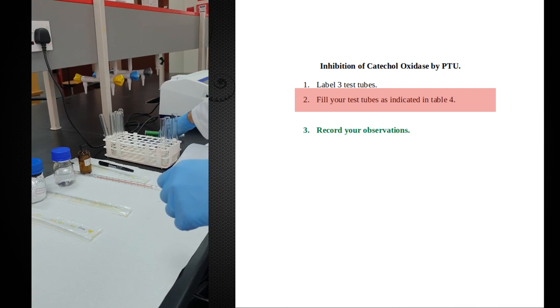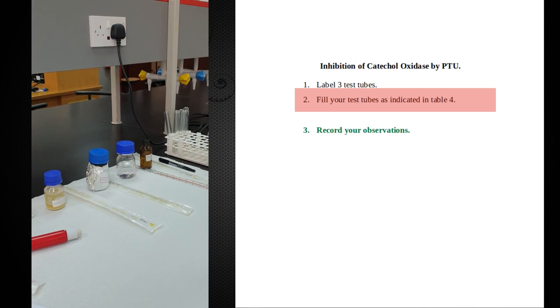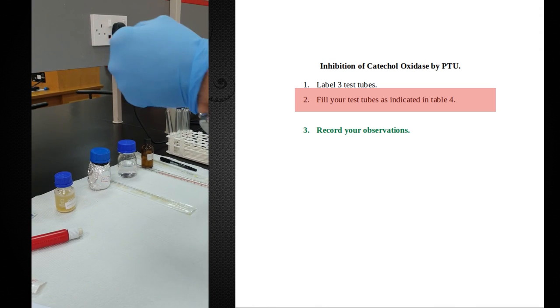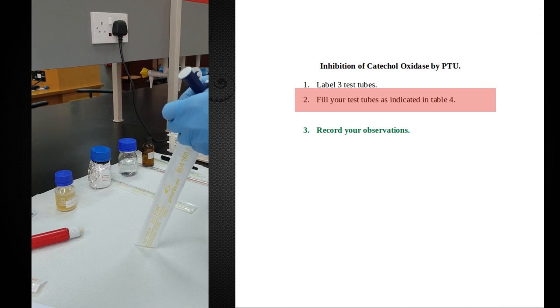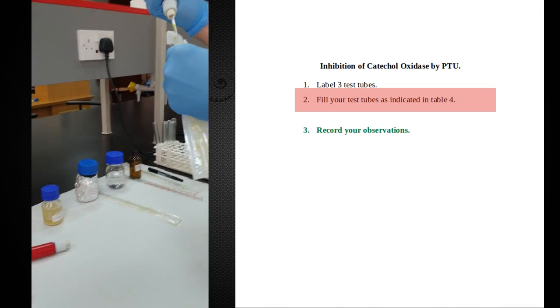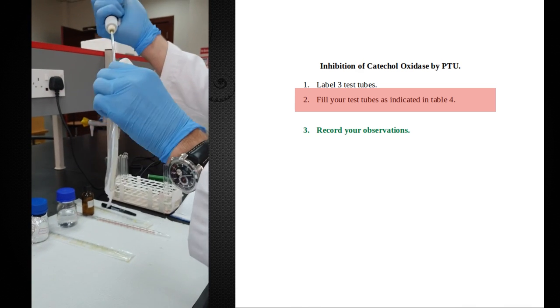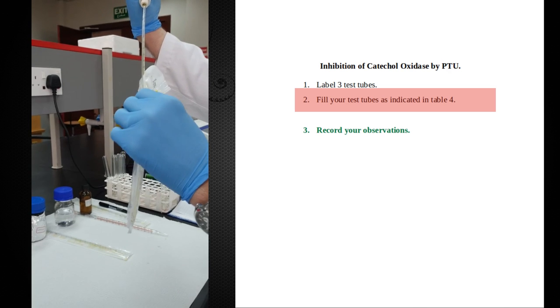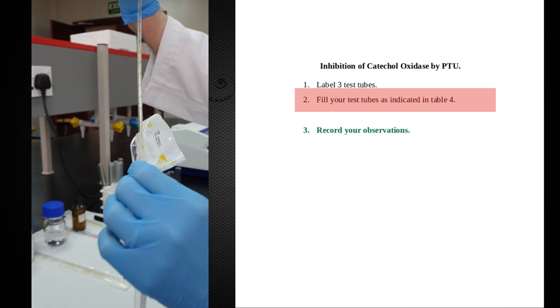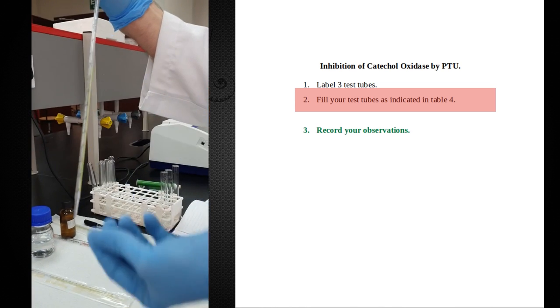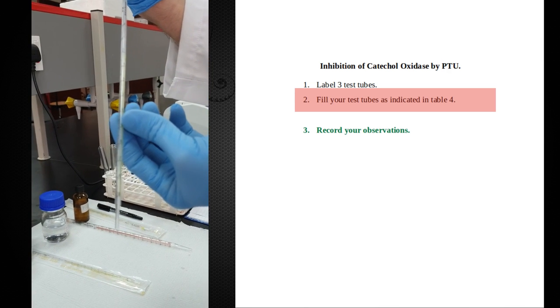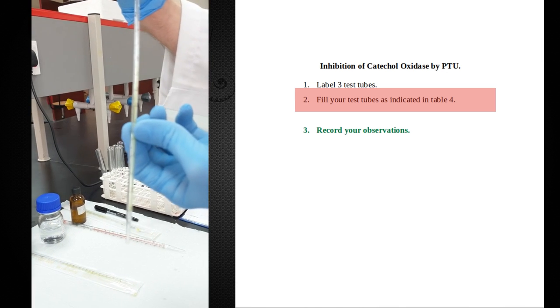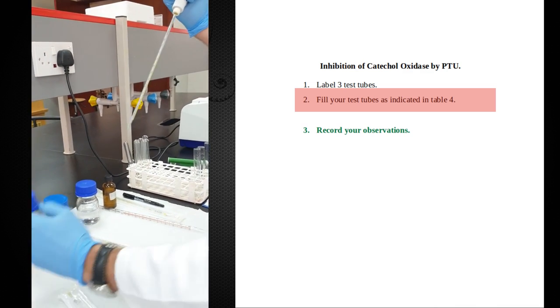Now I'm going to add potato extract to all of these tubes. That's the enzyme. This is a 1 milliliter pipette, so I'm going to use a different pipette aid. In this case the numbers indicate decimal places. This whole pipette from 0 to the tip is 1 milliliter. If I'm trying to get half a milliliter, that's up here at 0.5. That's how much I'm going to load into each tube.